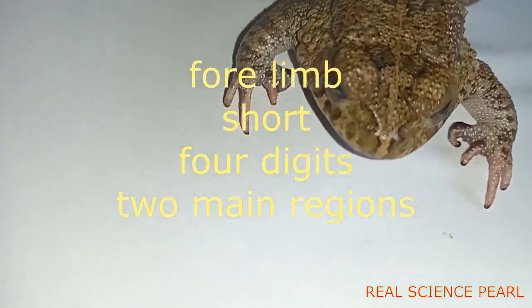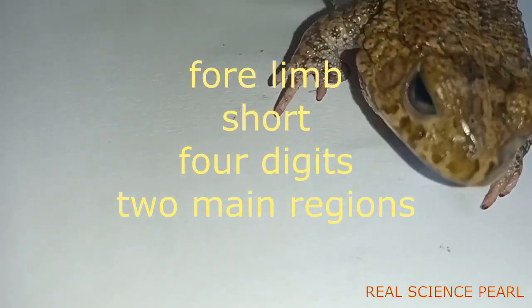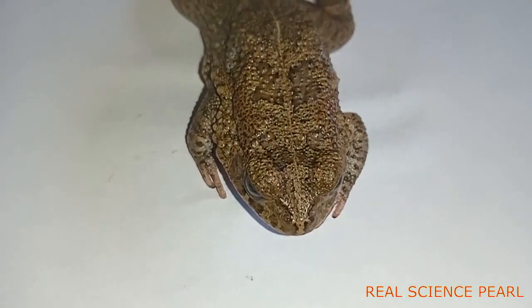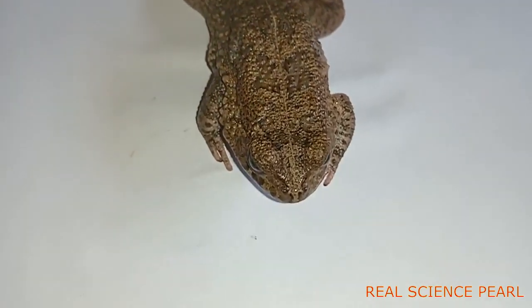The fore limb also has four digits, which enable the specimen to dig burrows in the ground to hide from predators. The fore limb also has two main regions: the upper arm and the forearm.